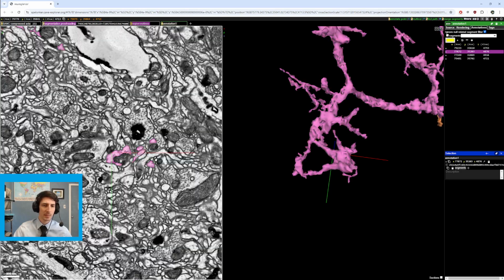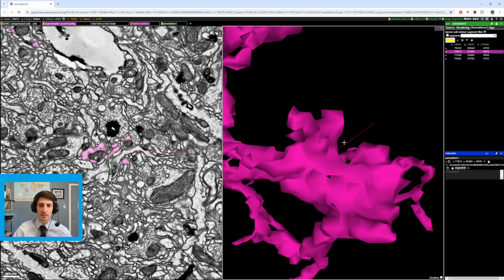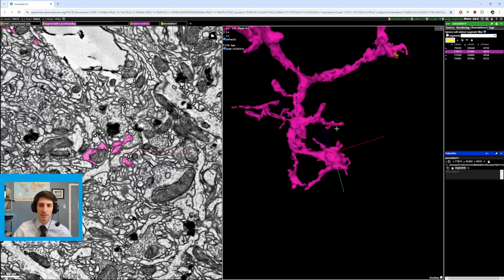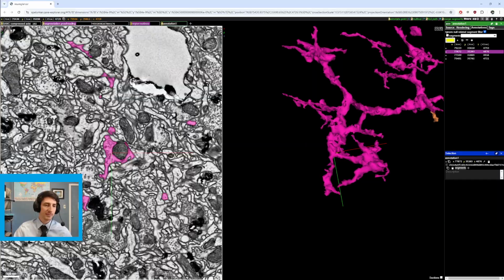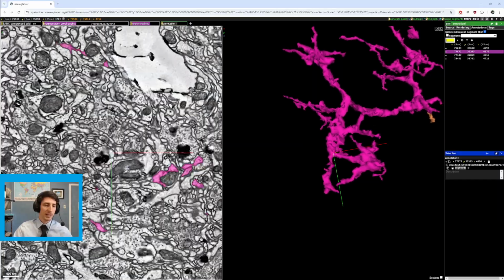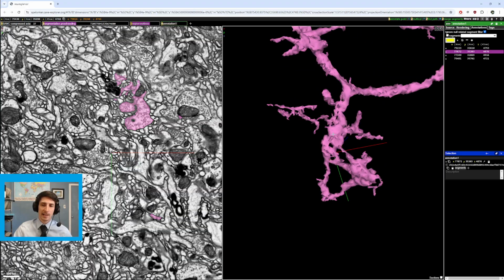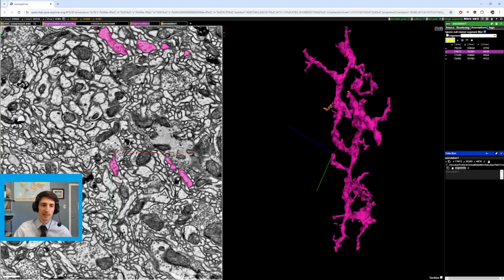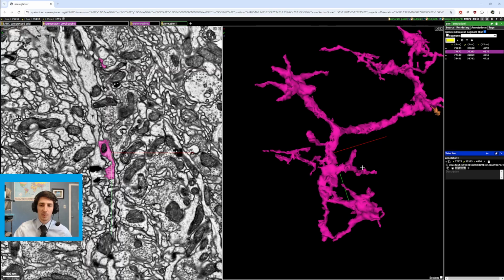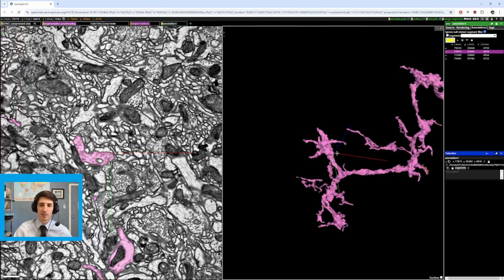As you can see, there is a bit of a merger here. Some of these bits are merged, but that is, again, a smaller type of merger. And it looks like this is just a naturally thicker branch. This is also an interesting piece here, but again, the motif of this Neurite was smaller, stockier branches.